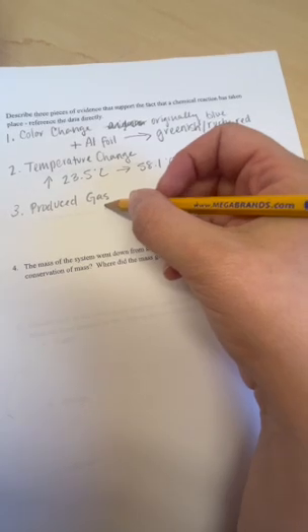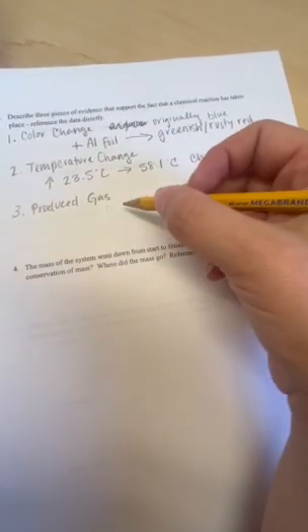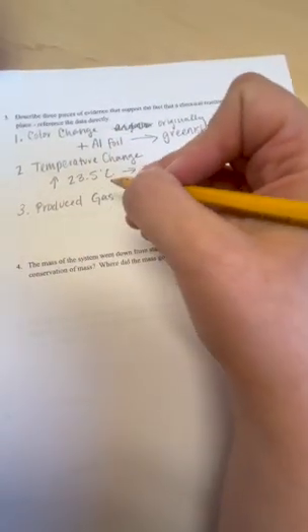Number 3, which we've already discussed a little bit before, was that we produced a gas. So the evidence of this gas was that steam-looking stuff that was coming up off the top of that beaker.